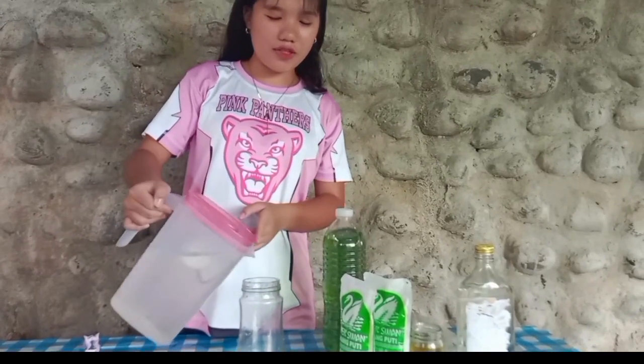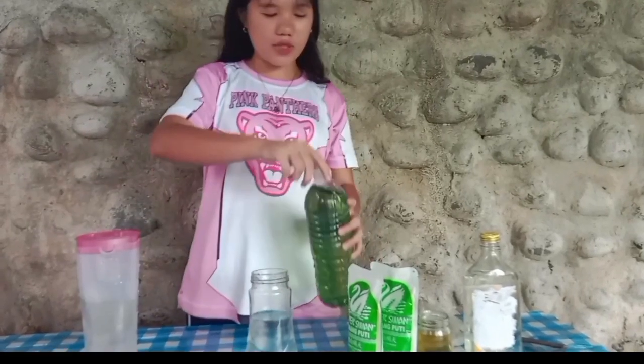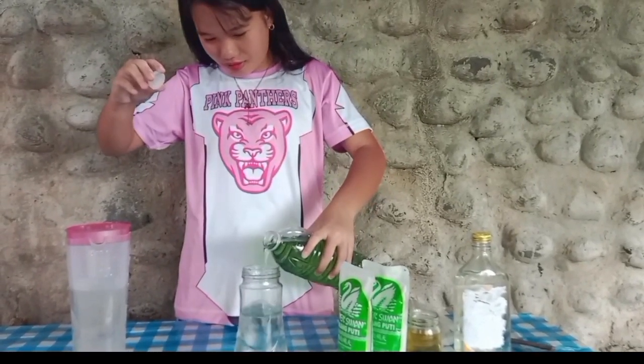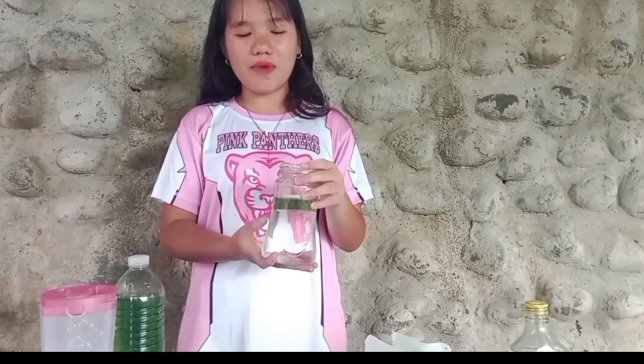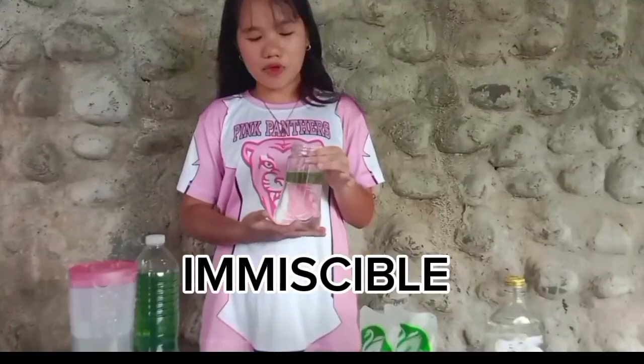We pour water into the jar. Also gasoline. So as we observe, the water and gasoline cannot mix together because water is a polar molecule and gasoline is a non-polar molecule. They are both immiscible.